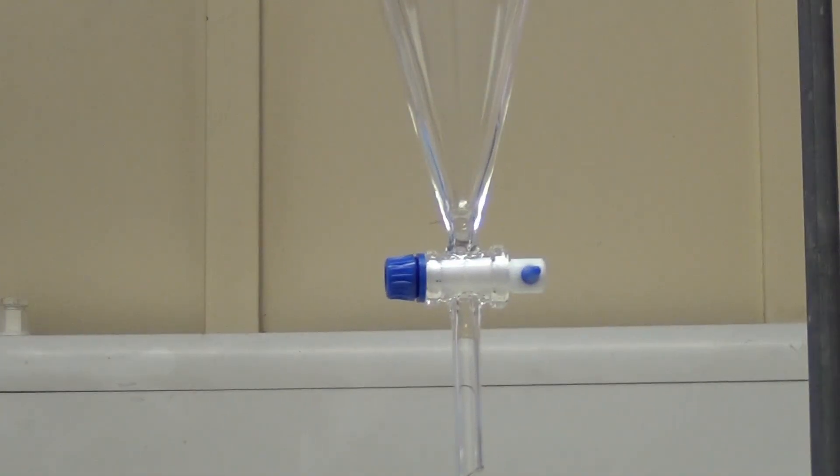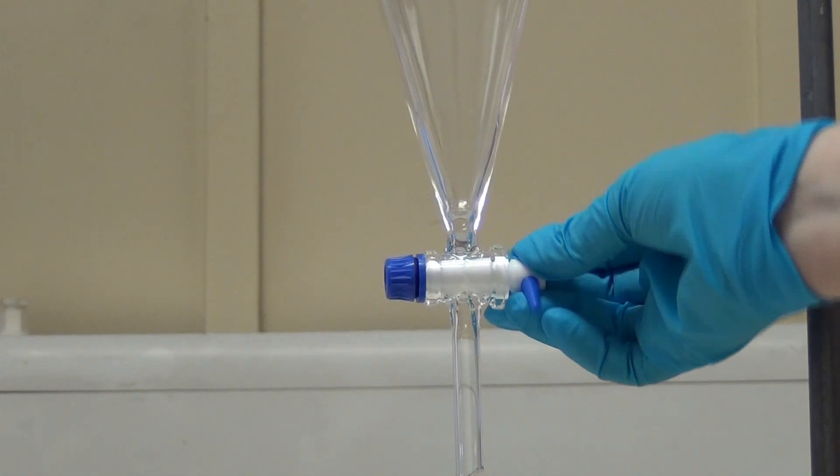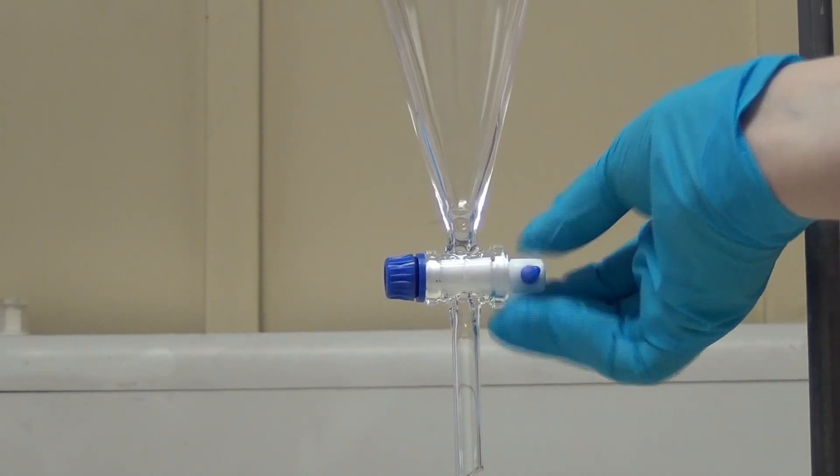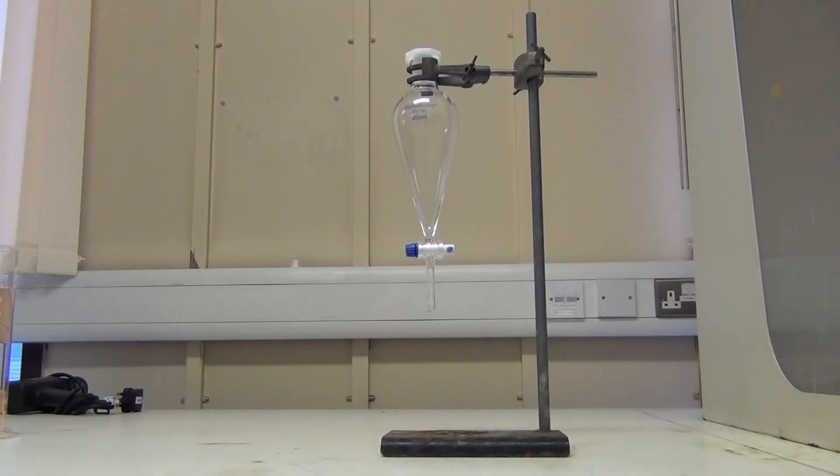Before transferring any liquids into the funnel, always ensure the stopcock is closed. When the tap is vertical, the stopcock is open, and when the tap is horizontal, the stopcock is closed.